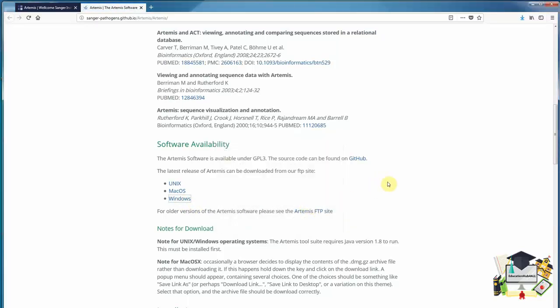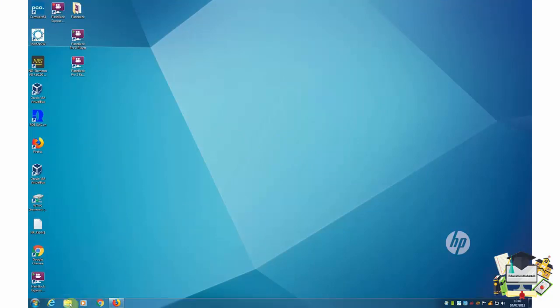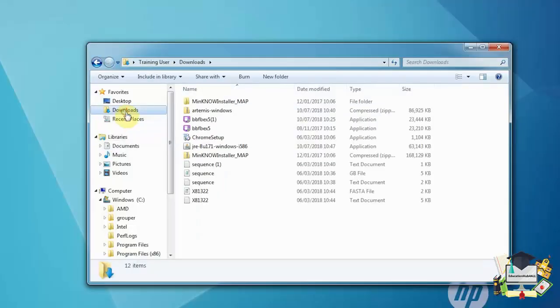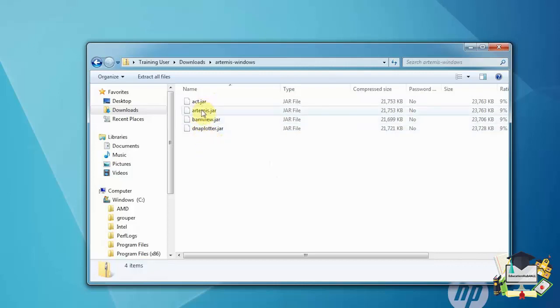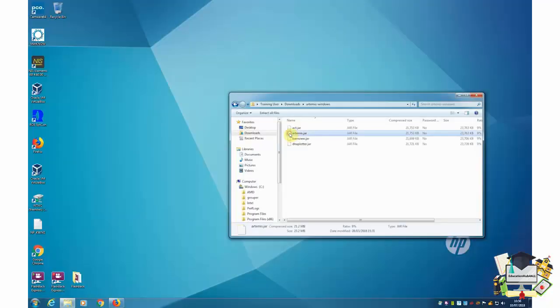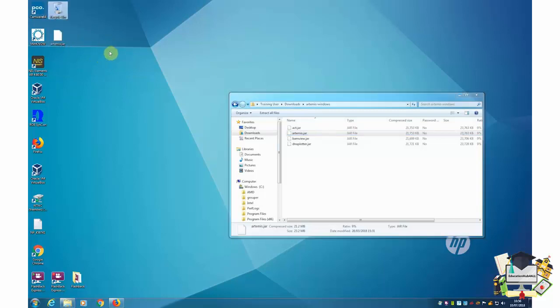This may take a few seconds to download. Once this is done, I'll minimize my browser and go to the software on the computer. I'll now browse to my download folder on my PC and click on the Artemis Windows compressed file. You'll notice there are four JAR files here: Act, Artemis, BAM view, and DNA plotter. We're only interested in Artemis. For convenience, I will drag the Artemis file to my desktop. I can now just run this by clicking on the icon.